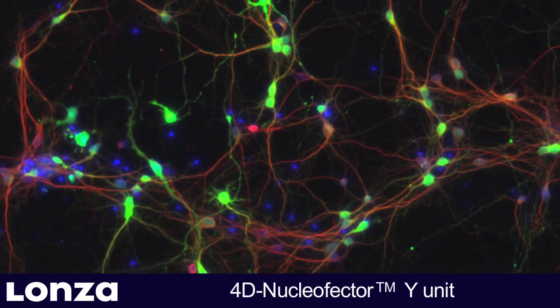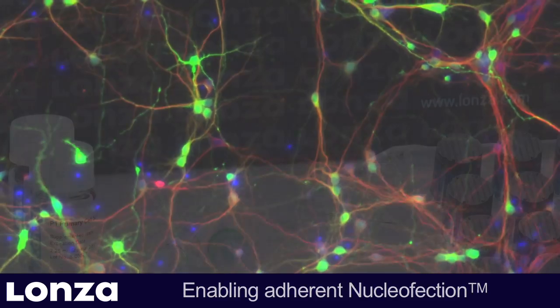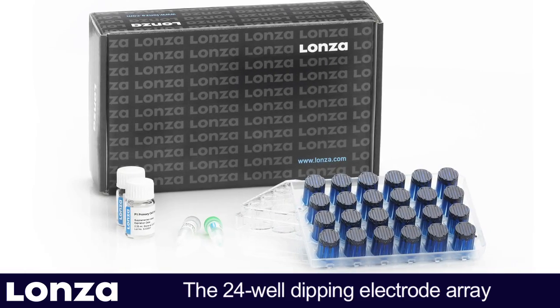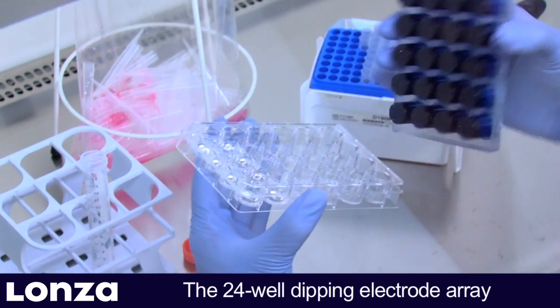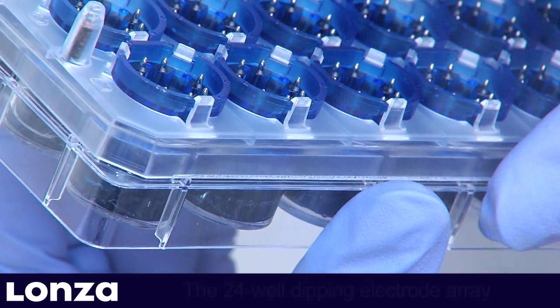In this video, we demonstrate how to successfully transfect adherent cells, in particular neurons. The Y-Unit uses disposable conductive polymer 24-well dipping electrode arrays that are inserted into standard 24-well culture plates for transfection.